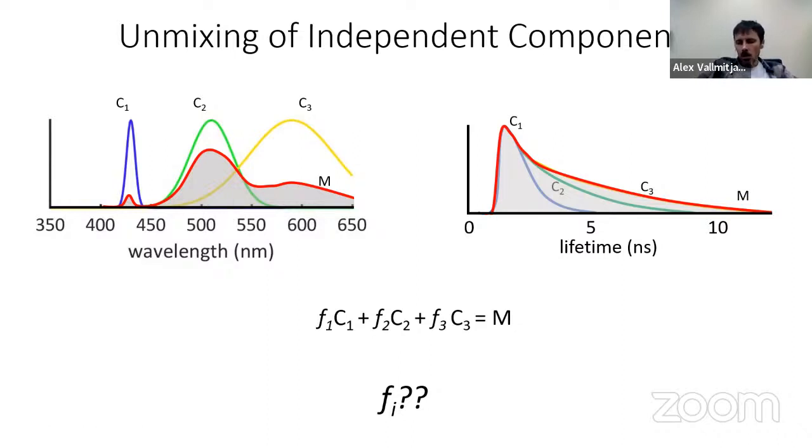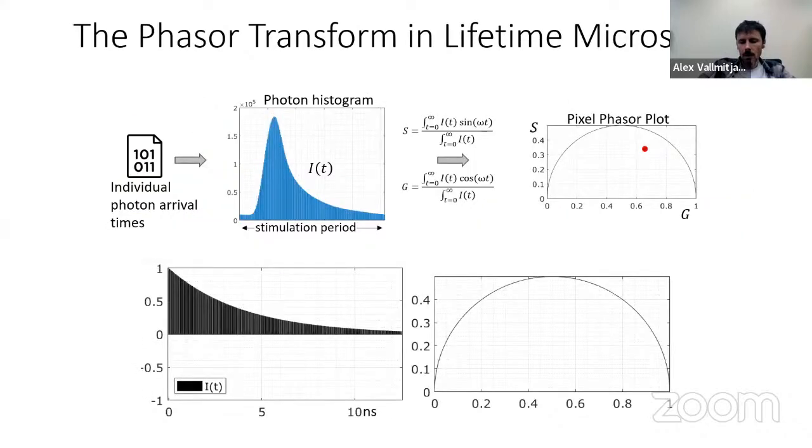The work we did was using the same idea, but in the phasor space, which leads to fewer equations, and it has some differences, as you will see now. I'm not sure if this is overkill, as you probably have just had a talk on phasor. I may just reiterate in my own words the basic concepts required for this.